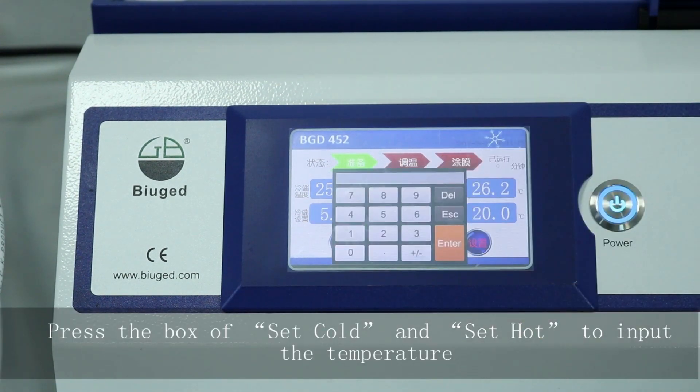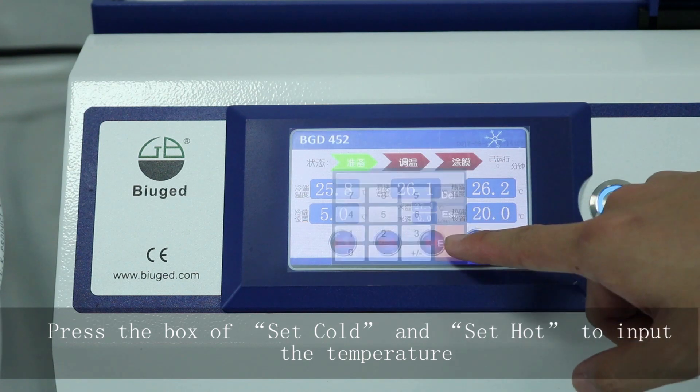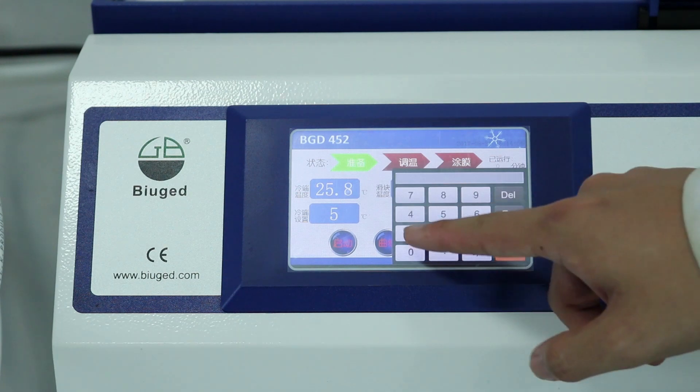Press the box of set cold and set hot to input the temperature, then press enter to confirm and return.